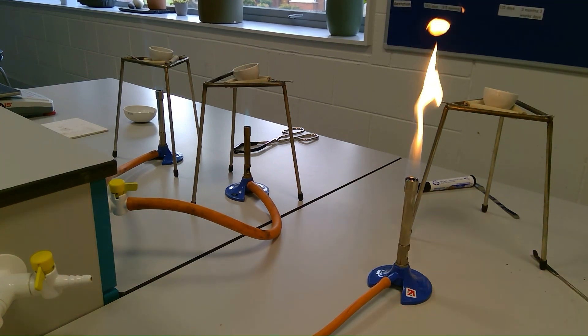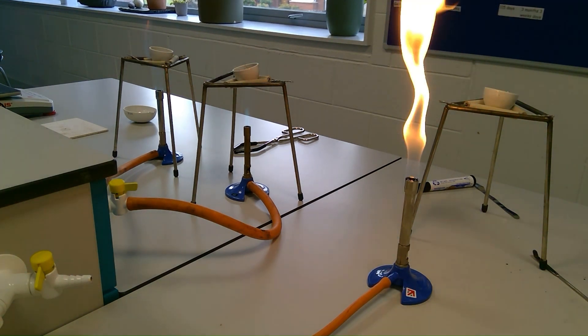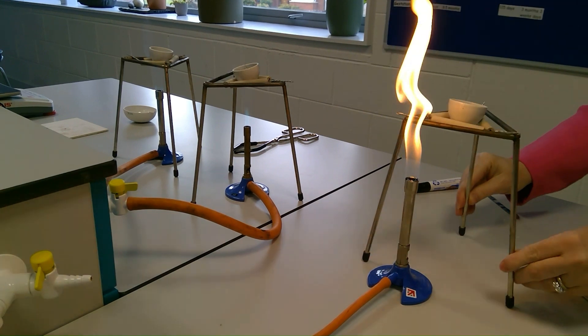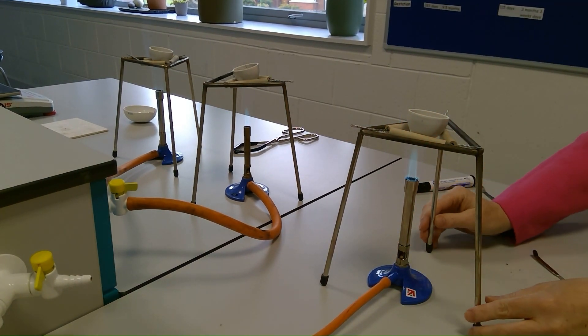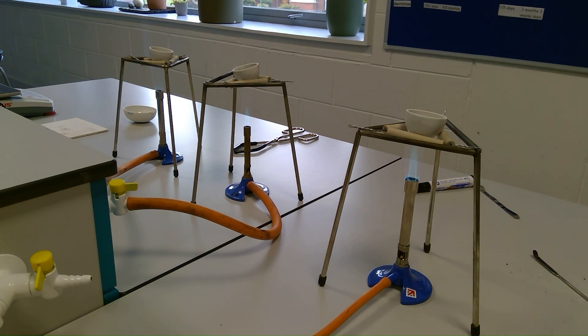And I'm going to move the tripod over the flame. I'm not going to touch the bunsen burner, and then I'm going to open it up so that the flame is directly below the crucible.